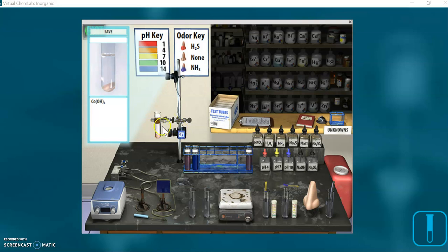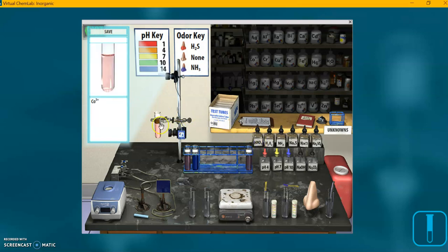I'm going to do a further test on our precipitate solution. Going back over to HNO₃ and clicking it — there we go, an immediate change. We can see the cobalt ion is free here. Even if the screen didn't tell us — like in a practice or real unknown — you can see by this pink, clear solution that we have cobalt. That is the confirmatory test for the cobalt ion.